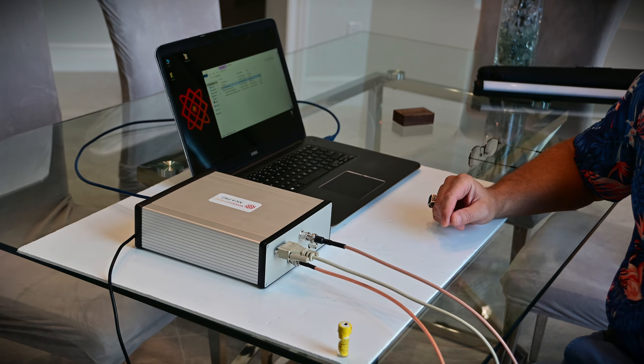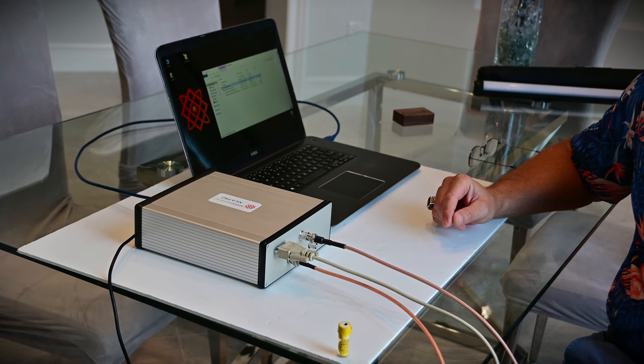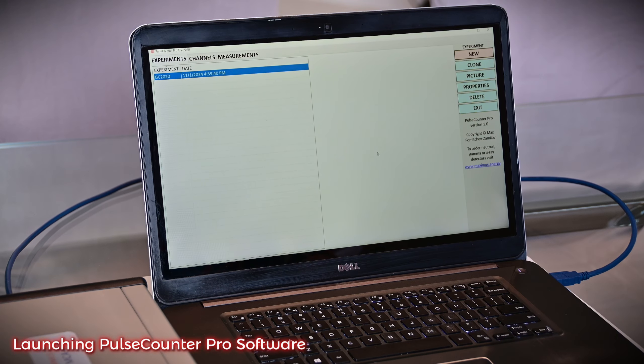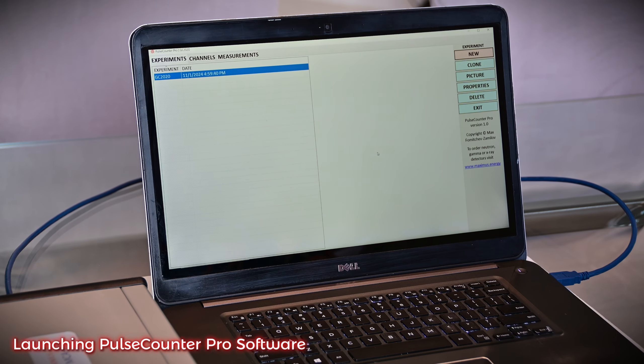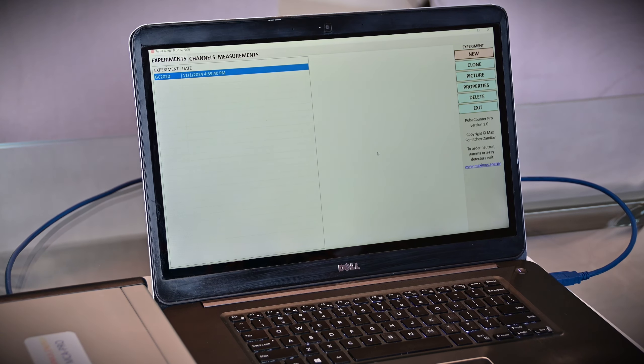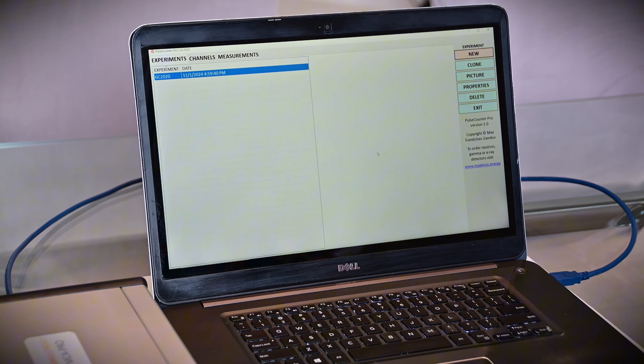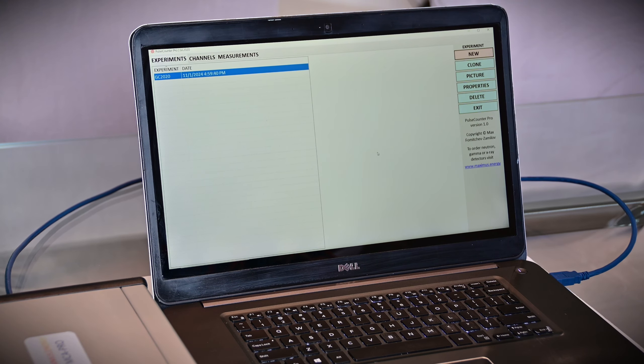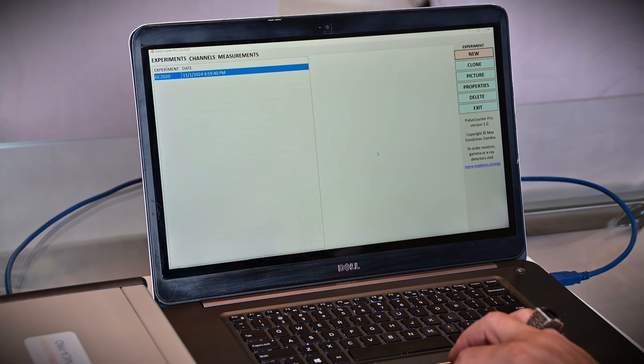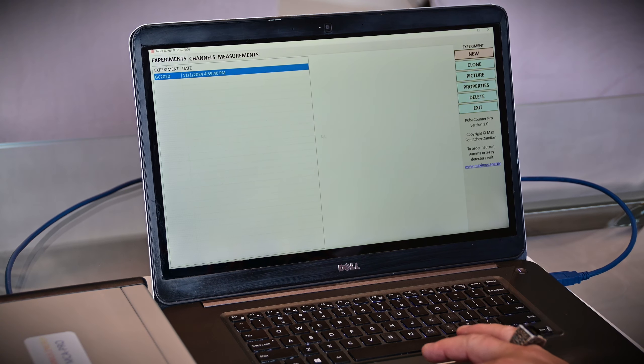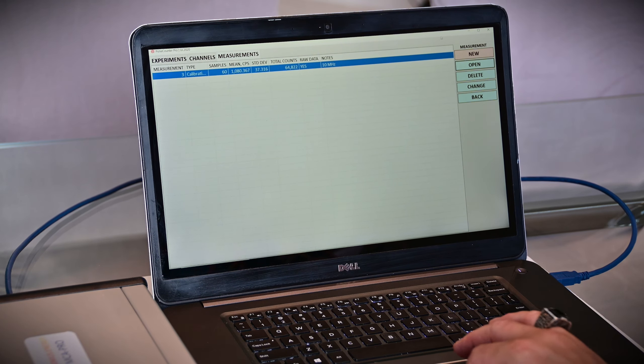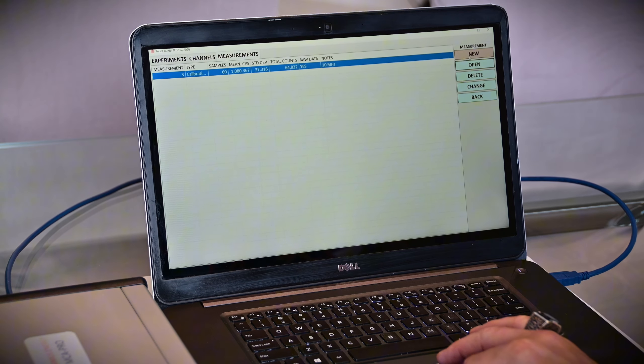Now we are ready to launch pulse counter software. If you buy a germanium system from me that comes with MCA Pro, it will come with pulse counter project already configured, and you don't need to do anything to acquire spectrum. If not, you will need to create a new project and set up a preset for your detector. In this case, I have already a project set up, and I'm going to start a new measurement.